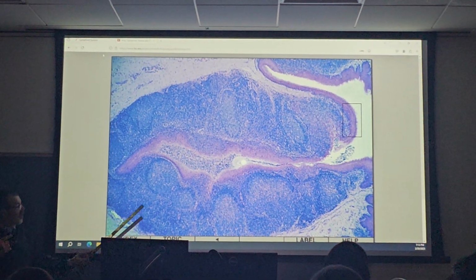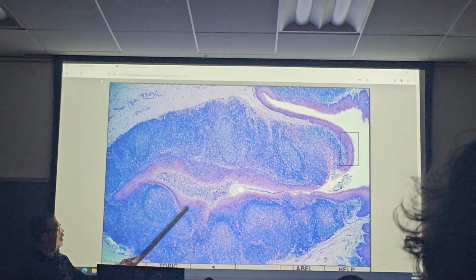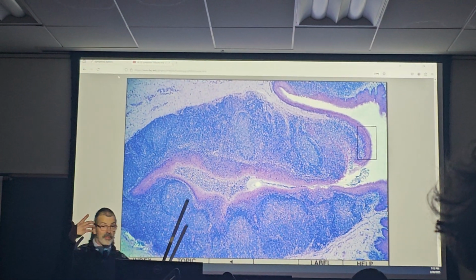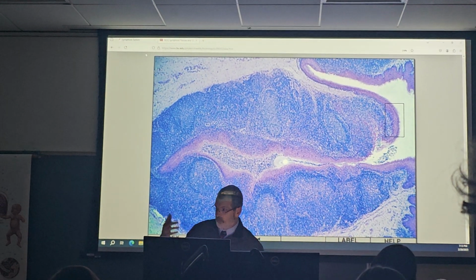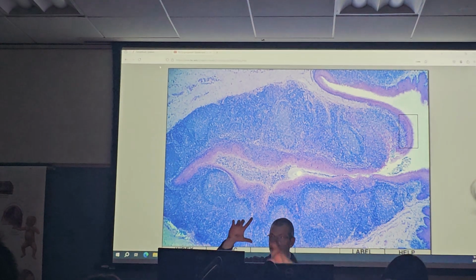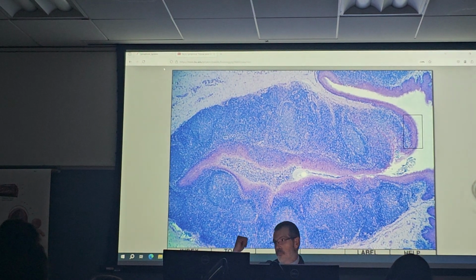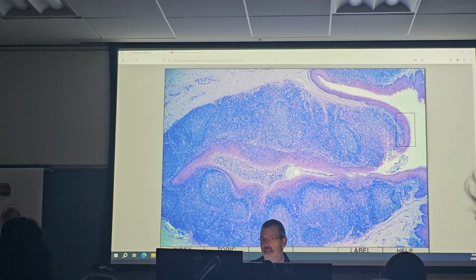So on a tonsil, you have big nodules, really big, a spotted caterpillar with a mouth and a gullet making the crypt. It looks like a node that flopped over itself, right? But that's a tonsil. So you went from ring to room to splatter to caterpillar. That's how you'd spot the difference between those when you're looking.